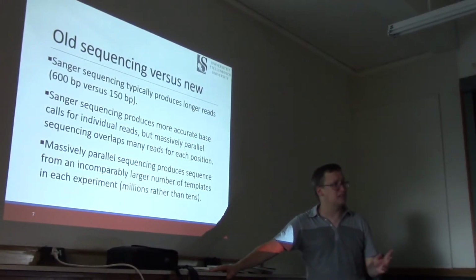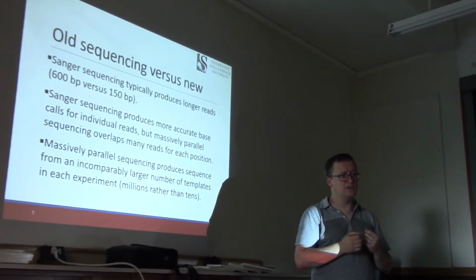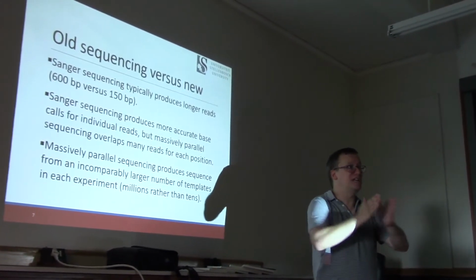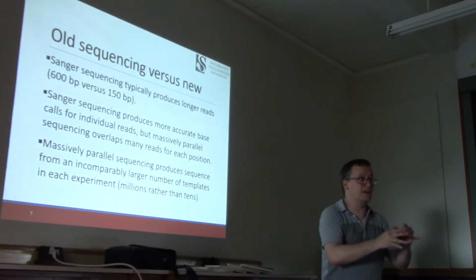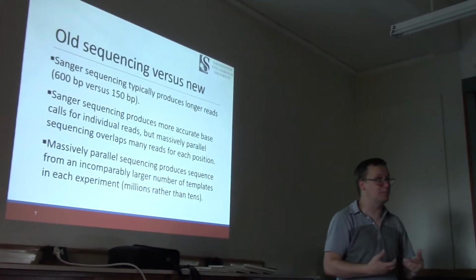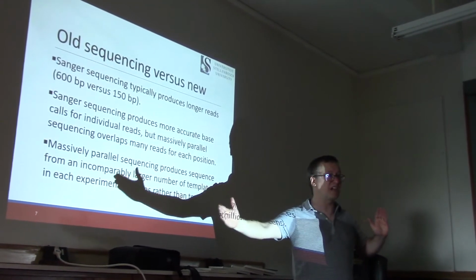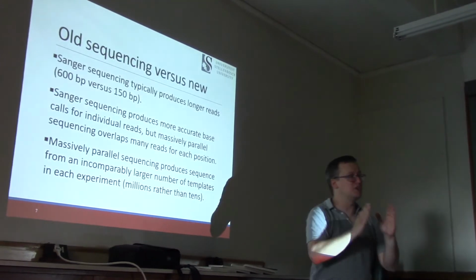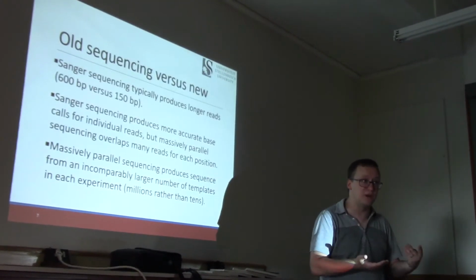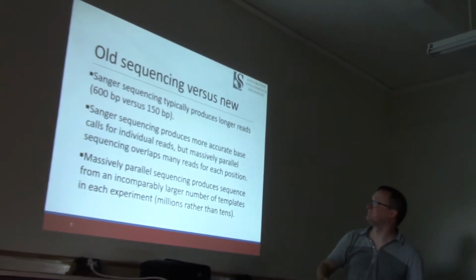There's a lot of reason to think that when you're sequencing a novel organism, doing so with a combination of very long sequences and a massive number of very short sequences is actually a nice gain, because the very long sequences help you with scaffolding, whereas the very short sequences, by the very large numbers, ensure that you have the nucleotide sequences correct.